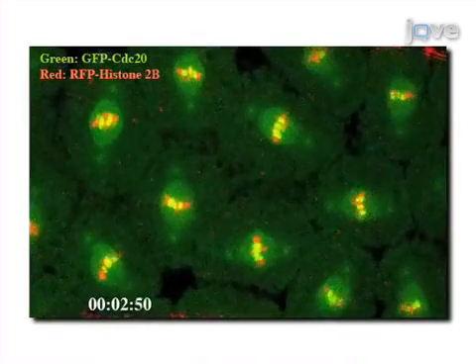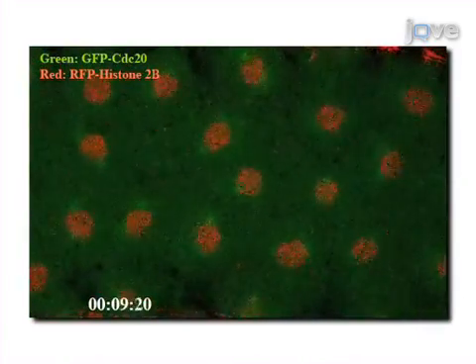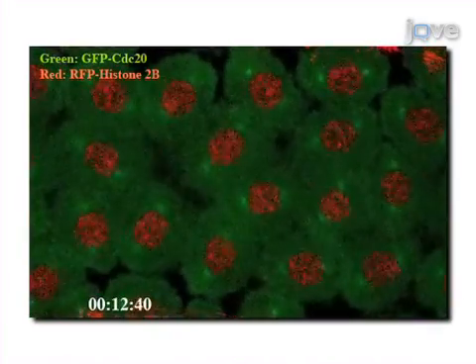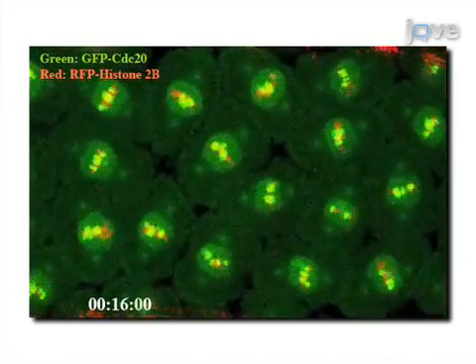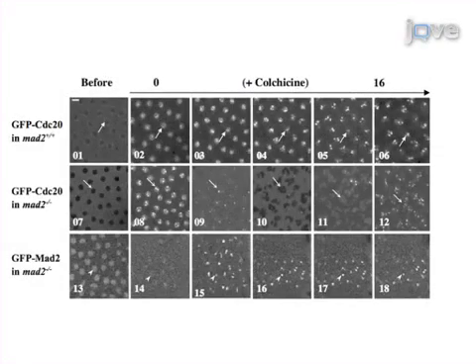Ultimately, time-lapse confocal microscopy is used to show spindle checkpoint protein co-localization, chromosome behaviours, and the effect of checkpoint-inducing agents in checkpoint-related transgenic Drosophila lines.